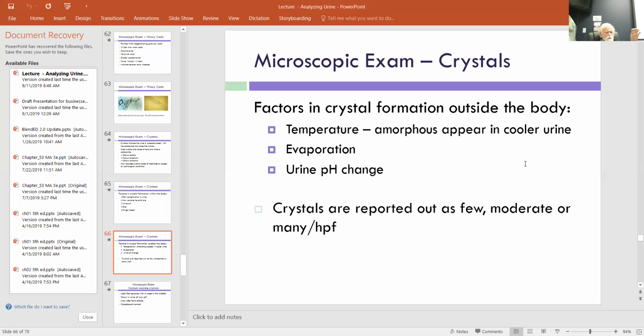You pour off most of that liquid and then swirl that and shake it up. And then it was much more visible that there was something there. Okay, so what we do is we look at the crystals that we see under the microscope, look at what some of those look like, and just make an estimate. You're making a very qualitative estimate: few, some, or a lot in our field.